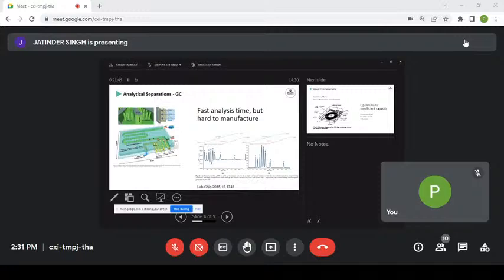What you need is a lot of surface area to have a lot of parking places for your analytes. You want to have capacity, a big parking lot, because you've got a lot of analyte molecules and they all want to find their way. To get a proper separation, it's not a process that should happen just once, but you want them to come onto the column and get off millions of times, and that's a dynamic equilibrium.